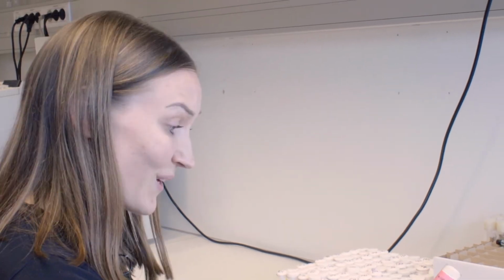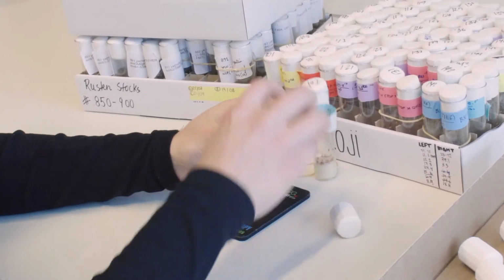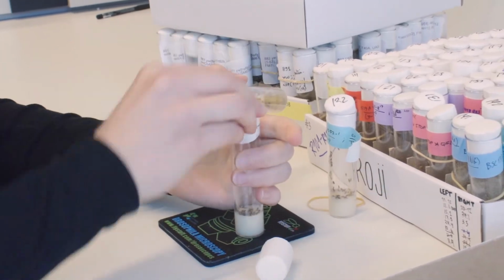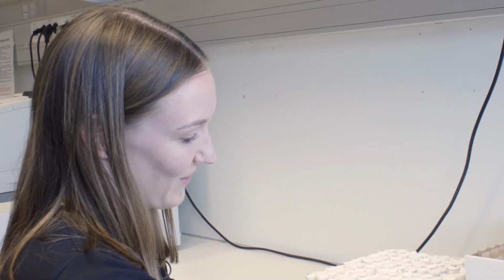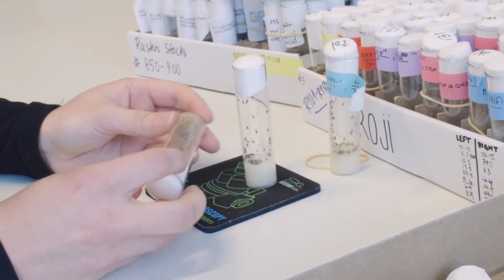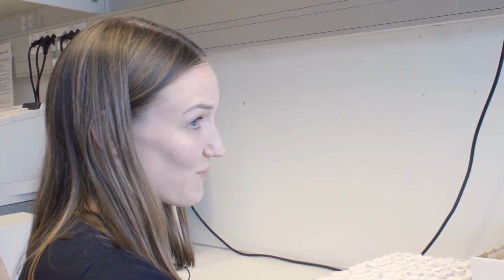The tapping is basically just because flies can fly, so you have to push them down in the vial so they don't escape. And then I transfer them over into the new vial and close them. Have you ever lost flies? Oh, of course. Everyone does. Normally they don't escape, but sometimes they do, but that's fine.